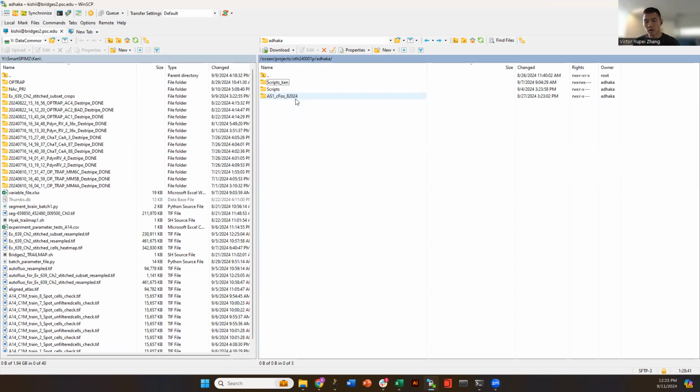Realistically, you don't want to just be sitting there doing nothing for another month or two. So the way I think is that ultimately this comes down to you needing a way to validate your classifier. And if the validation tells you that the classifier is doing an equally good job across the two batches, it's great. Even if you have two separate classifiers, if the results of that classifier are similar across the two batches, I think that's also fine, right?